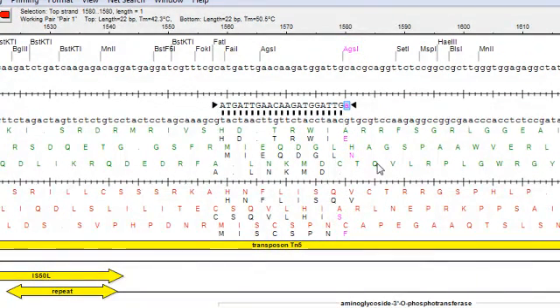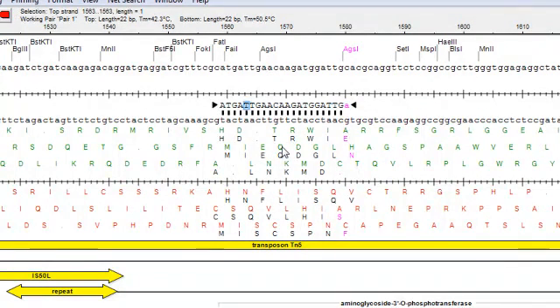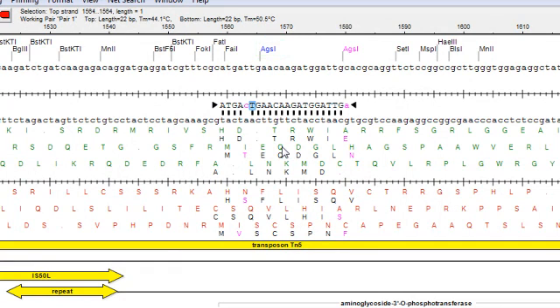Now, if there's a restriction enzyme whose recognition site is eliminated by an edit, like if I change this base here, those enzymes are shown in blue. And those colors are the same for any edits that you make in this view.